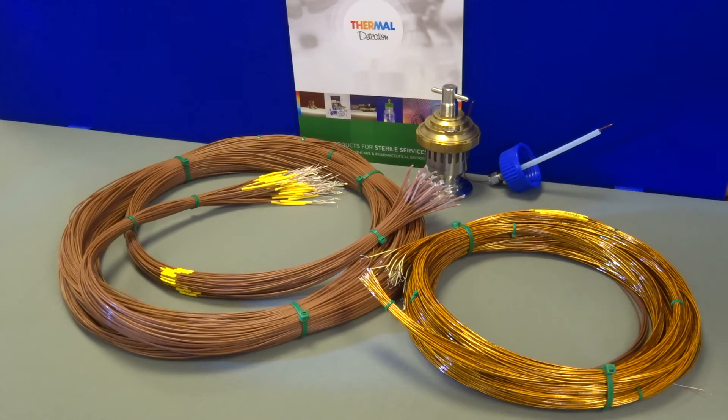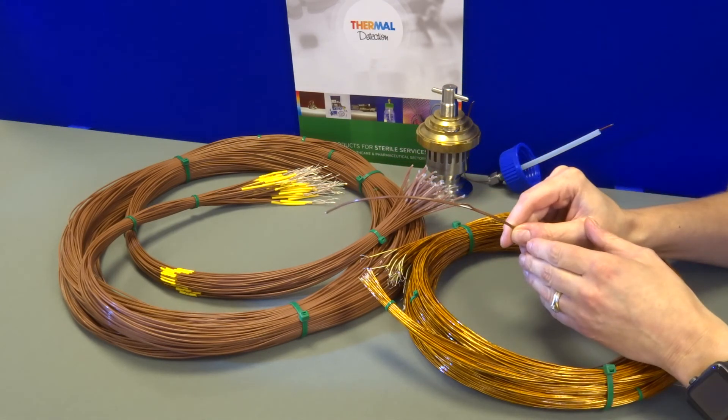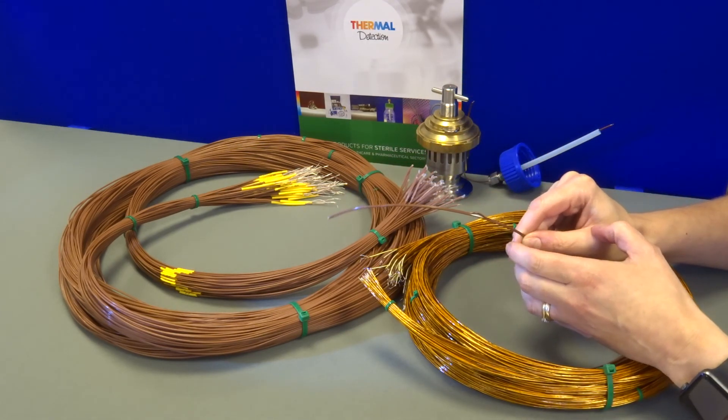If the cables are expected to be reused numerous times, then they can be prone to nicks and damage. Many customers request a weep hole at the lead end for security. This would allow the condensate to release and drip prior to reaching the instrumentation.